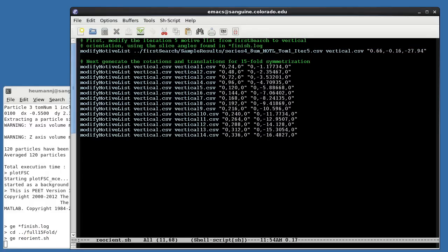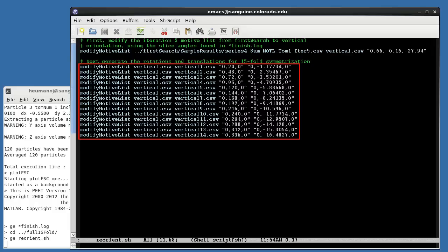Next, we repeatedly apply modifyMotiveList to vertical.csv, each time rotating by increasing multiples of 24 degrees, and shifting downward by increasing multiples of 16 fifteenths of a nanometer to generate motive lists vertical_1 through vertical_14. I could have iteratively generated vertical_n+1 from vertical_n by always rotating 24 degrees and shifting 16 fifteenths of a nanometer. This is less accurate, however, since it requires multiple interpolations and allows accumulation of errors.